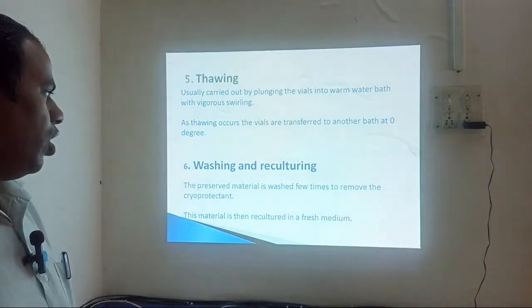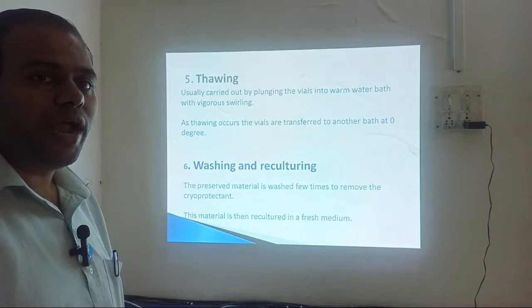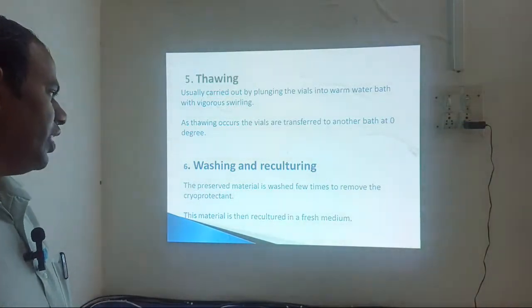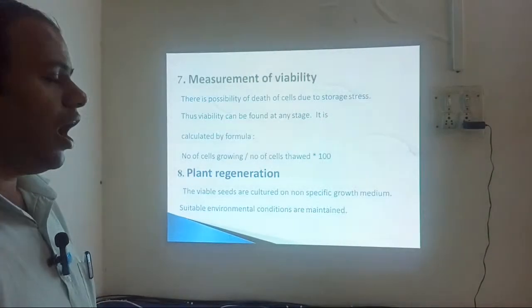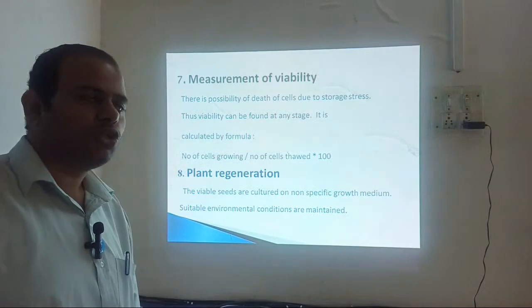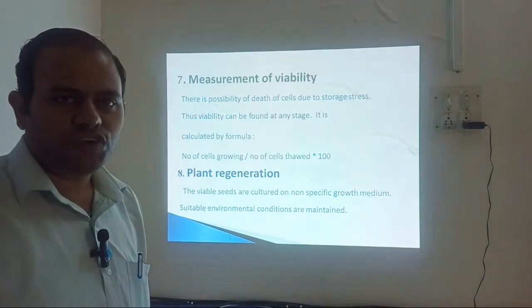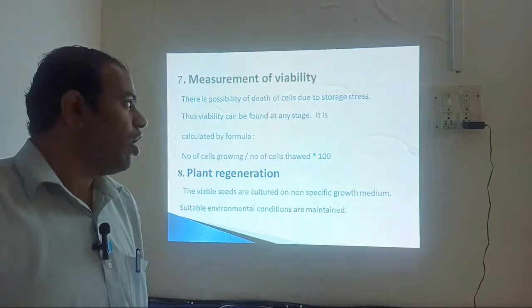You have to wash the material, because we have added the cryoprotectant into that, so you have to wash it first with double distilled water. After washing, the cryoprotectants are removed, then the material is cultured on the fresh medium. And after that you have to measure the viability, whether your tissue is live or dead. During storage, obviously there is a stressful condition for the cell. The cell may die in this condition, so for this purpose you have to check the viability.